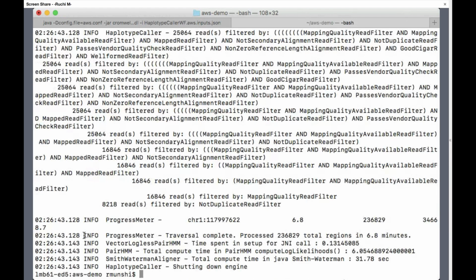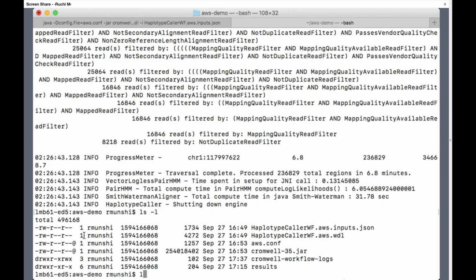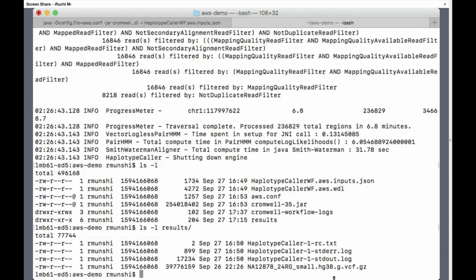And it can be verbose, it can not be, it really depends on the kind of toolkit you're using. And in this particular case, since my sample succeeded, I'm not going to dig too far into my standard out file, but instead, what I want to do is just investigate the contents of the actual output file generated. So I see that the VCF produced is right here.